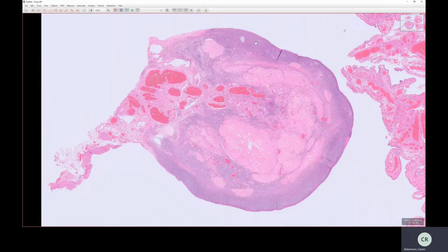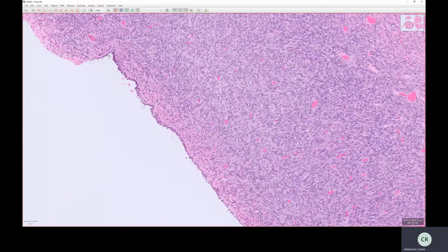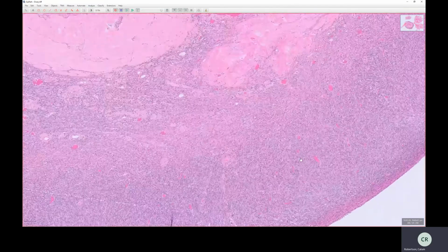The other part is right at the very edge of the cortex. It has this simple epithelial lining, which is continuous with the mesothelium that lines the peritoneal cavity. The ovary hangs in the serosal cavity, so that's what that is. So let's look at the ovarian cortex.